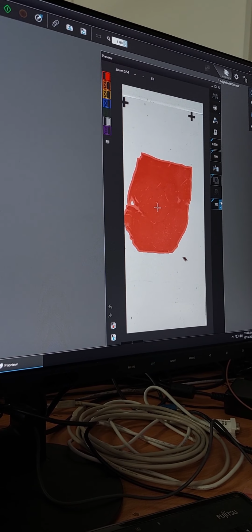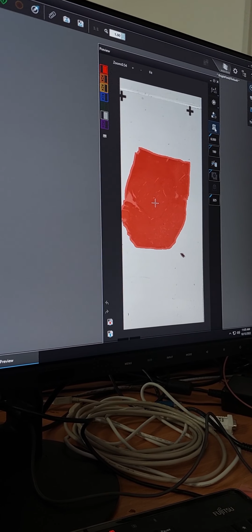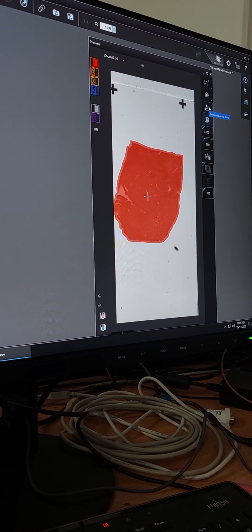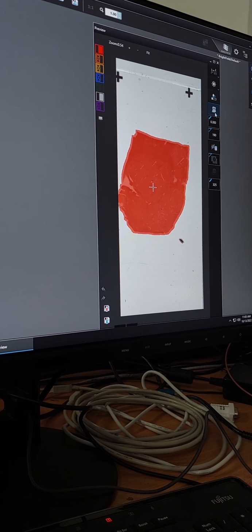I want to include that. There is no need to miss that from the scanning, and fill holes is always good. Technically, you could try to remove the areas that are out of the cover slip, but I think it is wiser to simply use this threshold.